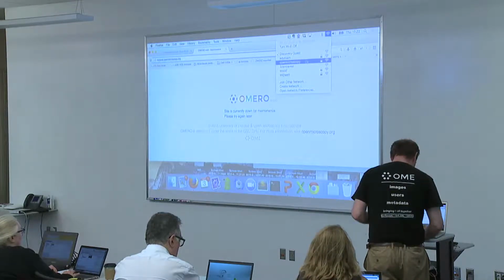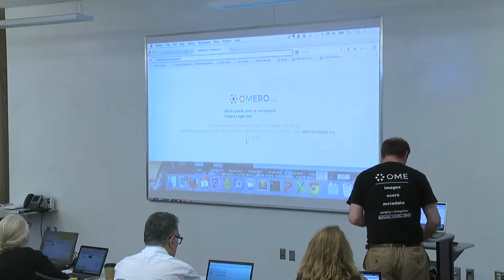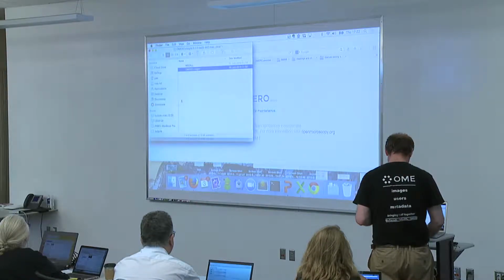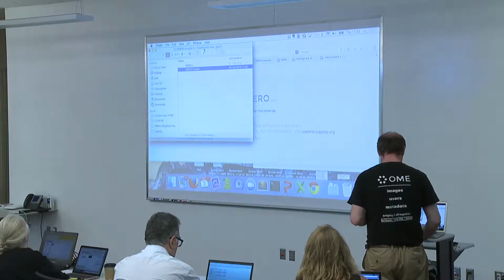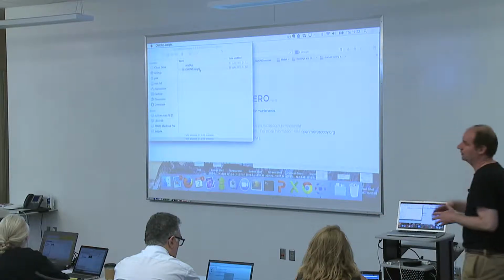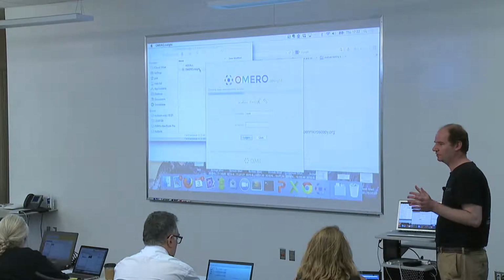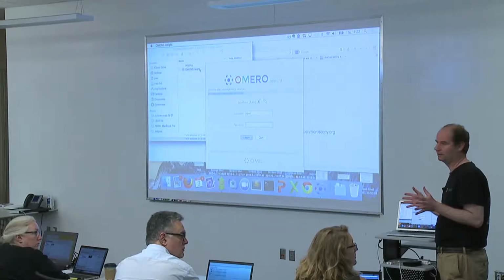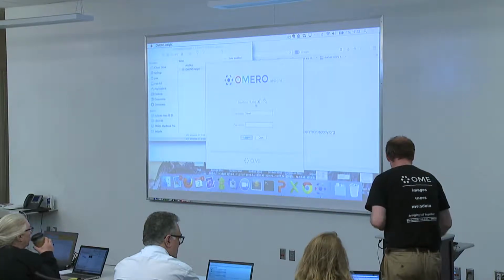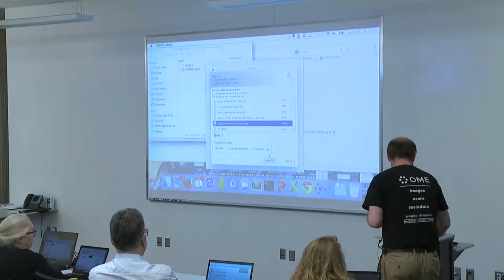So I'm going back to Open Microscopy because all the other guys have already everything installed. And we have to forget OMERO Web, unfortunately, for the second. For some reason, we are still having problems. And that's how the OMERO Insight looks like. So you just double-click on the application, as I'm doing here, and connect to the other server. Is anybody completely lost about what we are doing? Right, so I have to exchange my server. Don't get fazed by that, for obvious reasons.